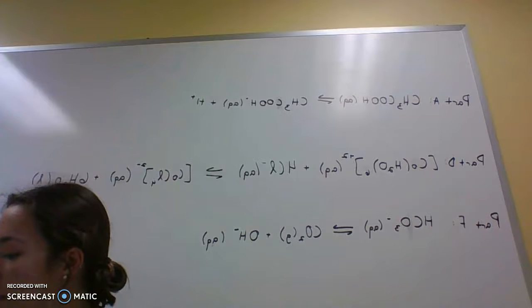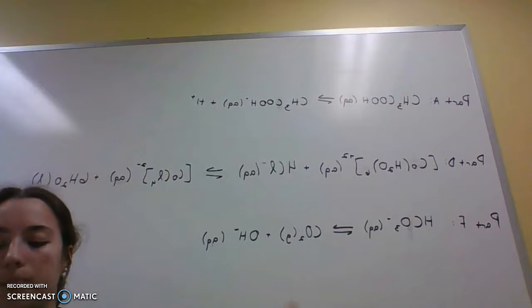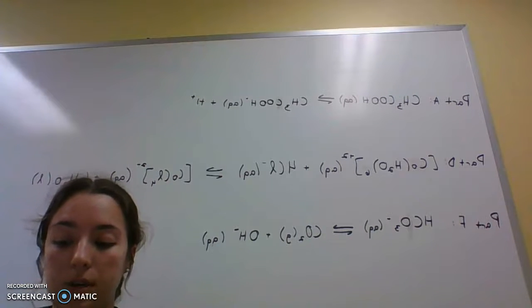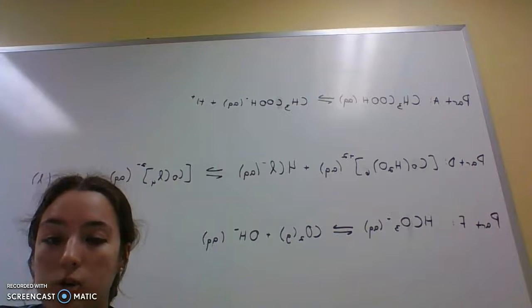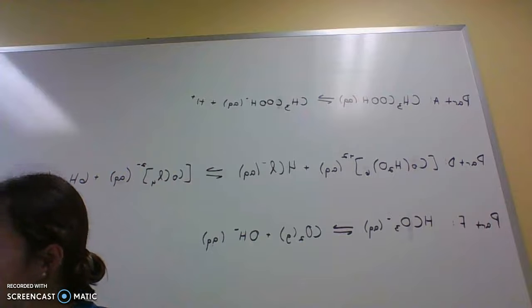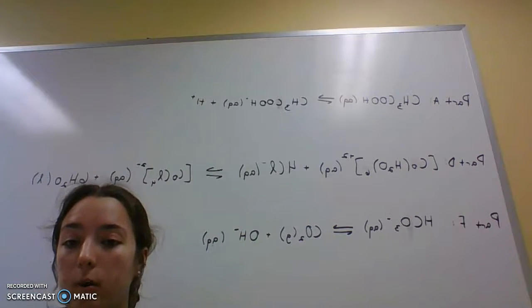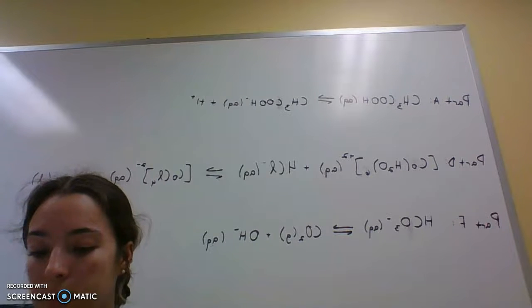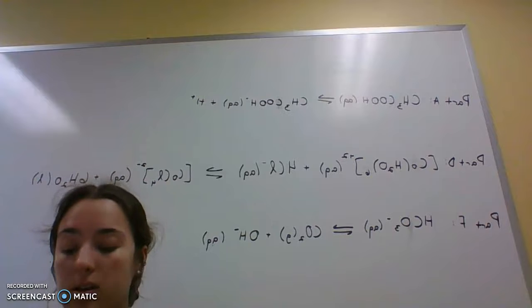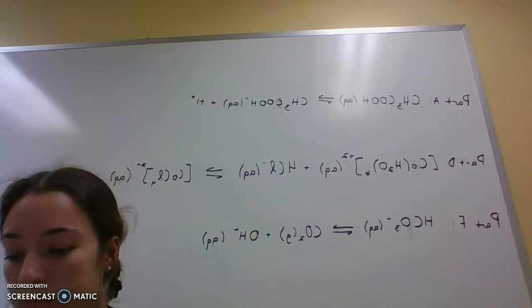So part F was the bicarbonate/carbon dioxide equilibrium. And the equation here, hopefully I don't get in the way of it, was HCO3 minus aqueous yields CO2 gas plus OH minus aqueous. So part A was which chemical species was removed by aspiration. So the stress that was being applied to this part of the equation was when the solution was attached to a vacuum aspirator, which removed the gas in the solution. And this gas was CO2. So the CO2 was the chemical species that was removed.